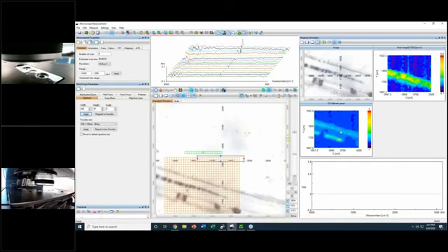And in this region, in the Aliphatic Group, this region here that is in blue and lighter blue, and also this region that is a little bit red, there is a higher concentration of the Aliphatic Group, and for the ester group that is at the 1735 wave number is this region in the middle.